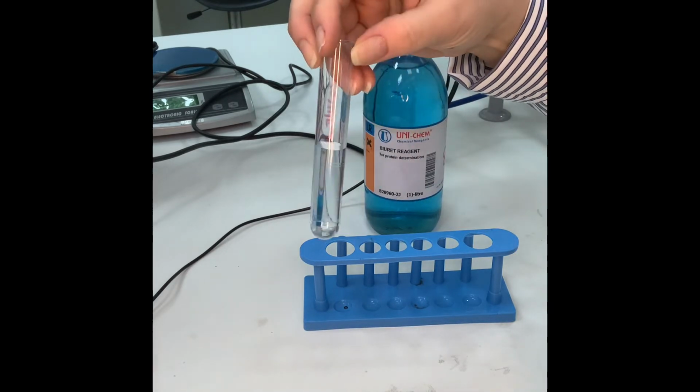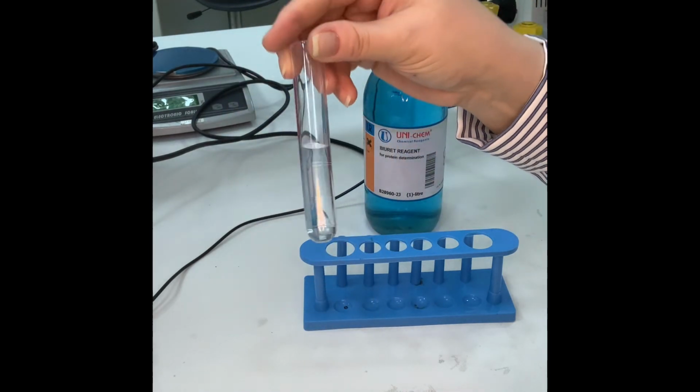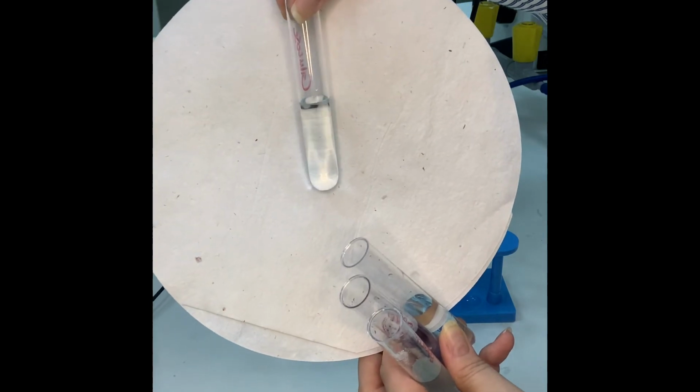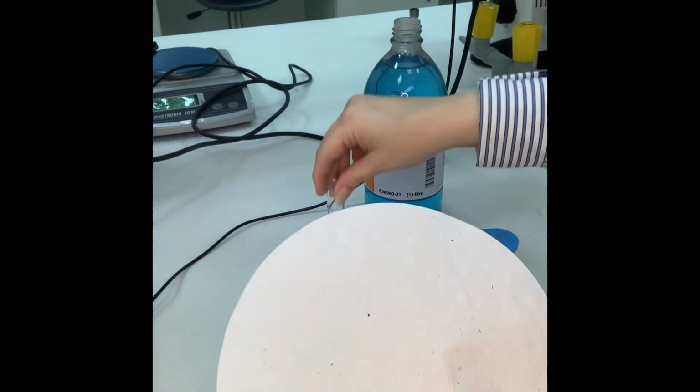Now when you look at the glucose, no change, it stays blue. I will just show it to you on a white background in a minute, just a second. Hold your thoughts. See? It's very light blue, no change. This is for the glucose.